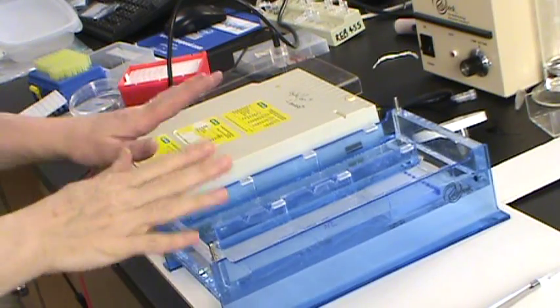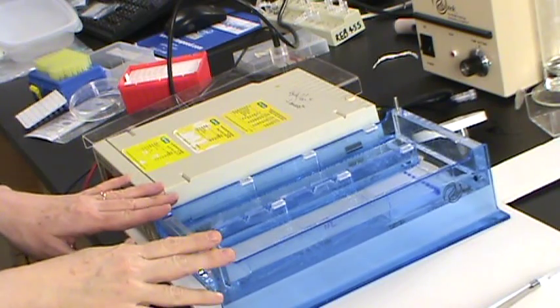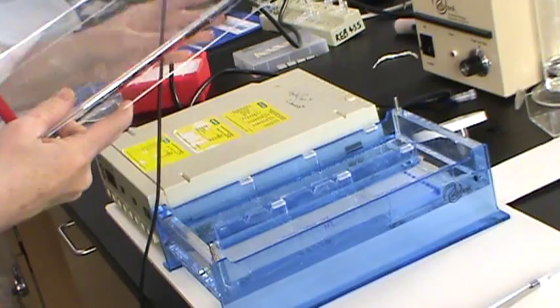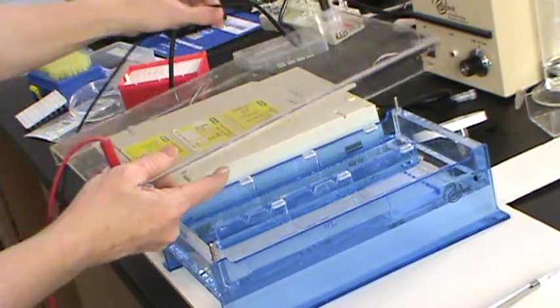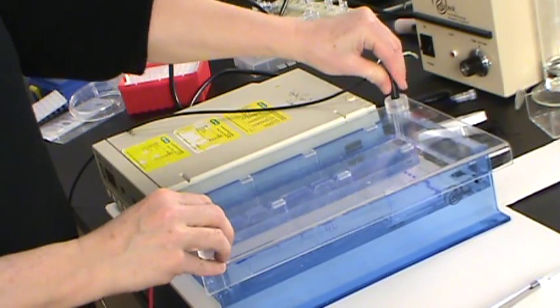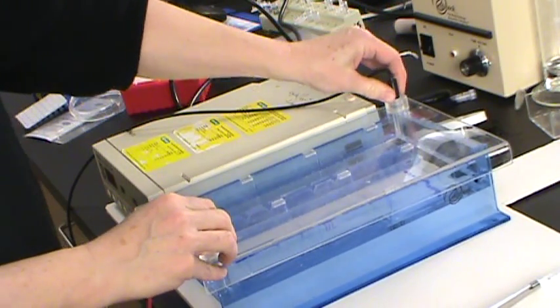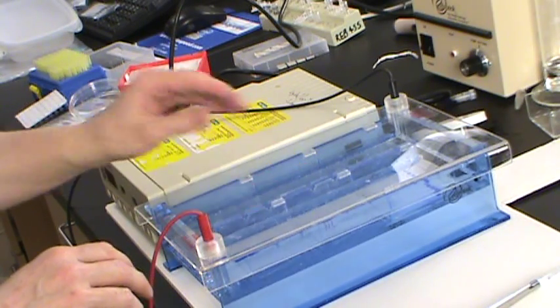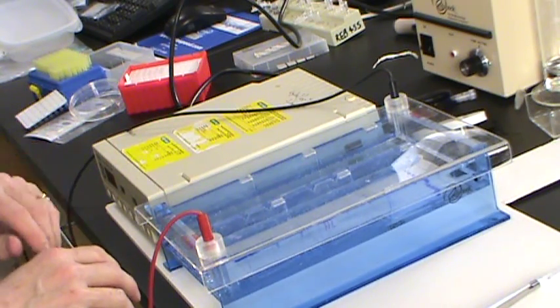Now once everyone has their gels loaded, we want to put the cover on the electrophoresis unit. Make sure that we have the black terminal on the black end, the red terminal on the red end. The buffer that we're using is such that all of the DNA fragments are going to be negatively charged.